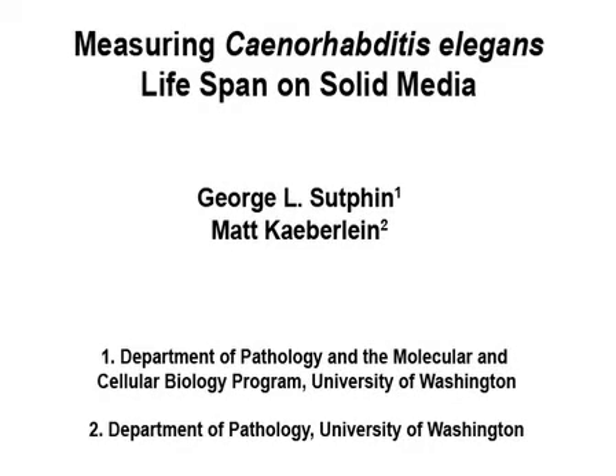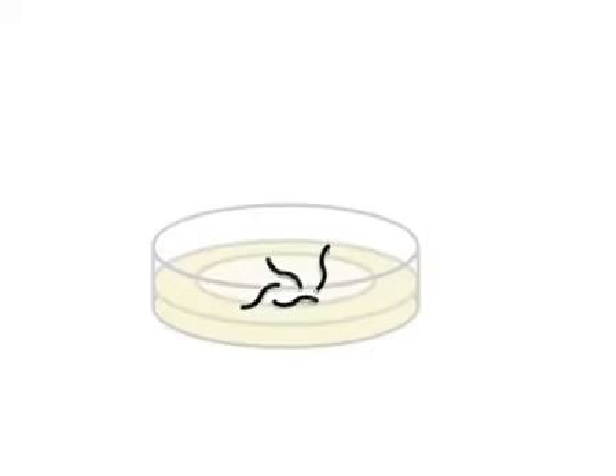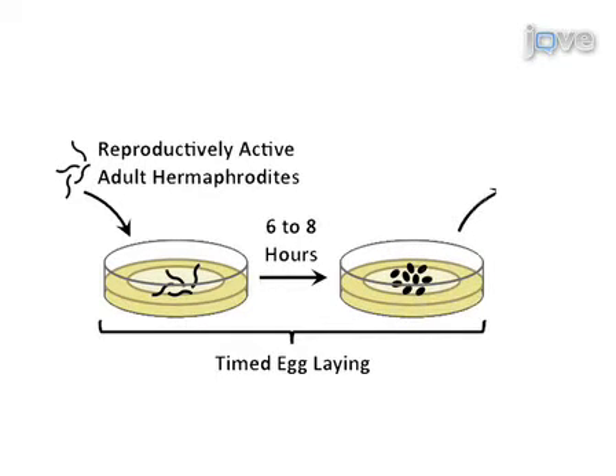In order to measure lifespan in C. elegans, an age-synchronized population is generated using a timed egg-laying. Reproductively active adult hermaphrodite worms are transferred onto nematode growth media plates seeded with UV-killed E. coli, allowed to lay eggs for 6 to 8 hours, and then removed.